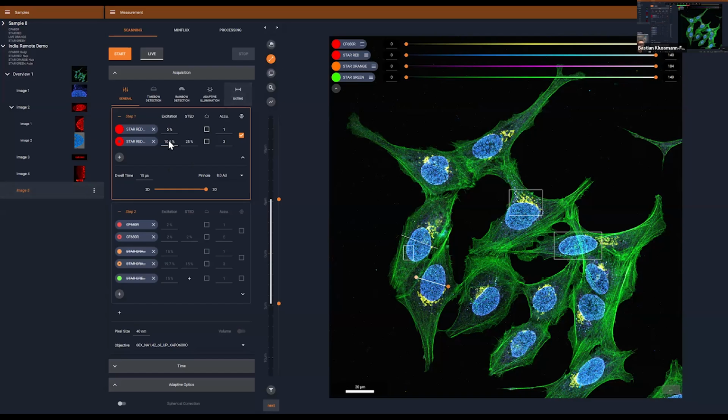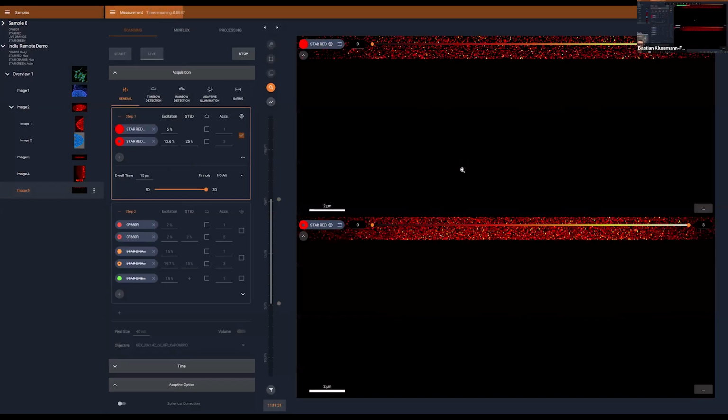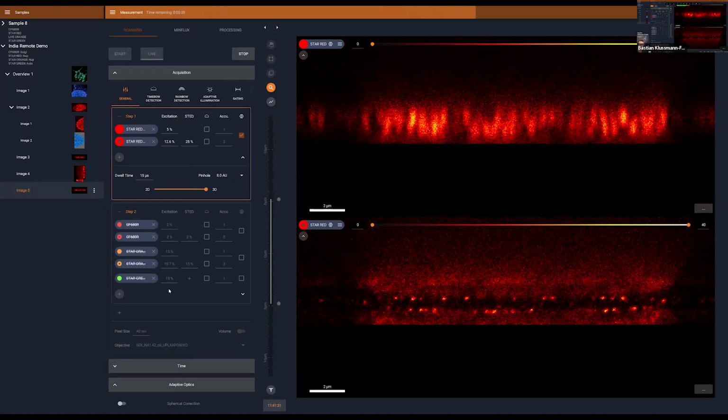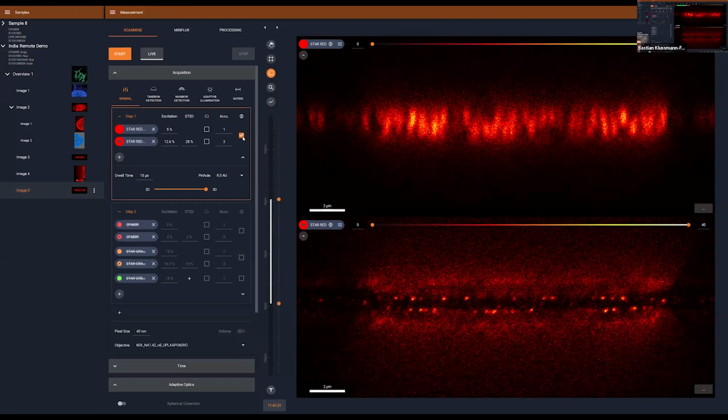So I can basically do this now, press start. We are still in 3D stat mode. Now it adjusts the spectral detection unit for the matrix detector because it sits in a certain position in the beam path. And now, what you might have recognized is that as soon as I activated the matrix detector, it puts the whole channel in a new frame step.